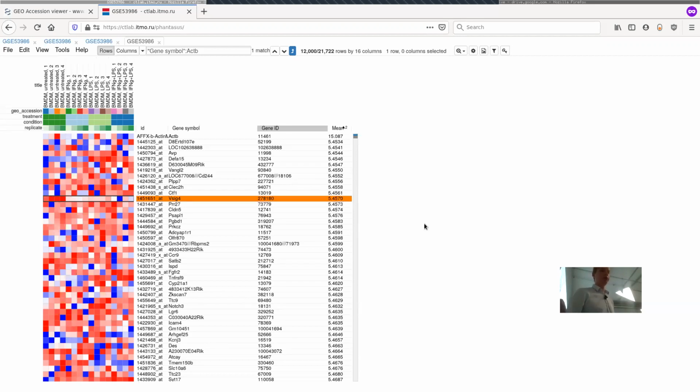But again, usually you're not that interested in the genes that are on the border. You don't want to lose the genes that are highly expressed, but for lowly expressed genes, usually it's not a problem if you lose them altogether. If you're looking for a particular gene, you can always look at it in the raw data. But otherwise, to get the overall picture, you don't need them much.